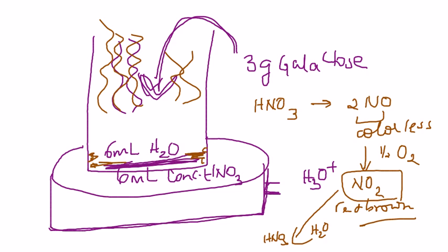At that point of time, you should remove the flask from the bath and add crushed ice to quench this mixture, and basically get the volume up to about 25-ish to 30 milliliter. You don't want to put too much ice, because if you do that, then at the end of the day you would be picking off pieces of crushed ice from the filter paper. Just give it some time, stir, swirl, have it cold. So if I were to add the ice, I would do it in lots, and as you do it, beat it a little bit, so that quenching and that release from the acid bath occurs in a very nice and efficient manner.